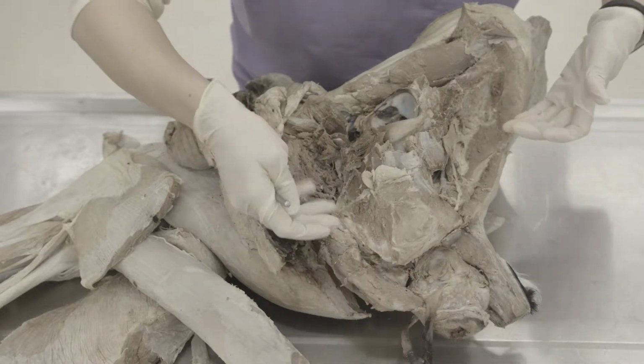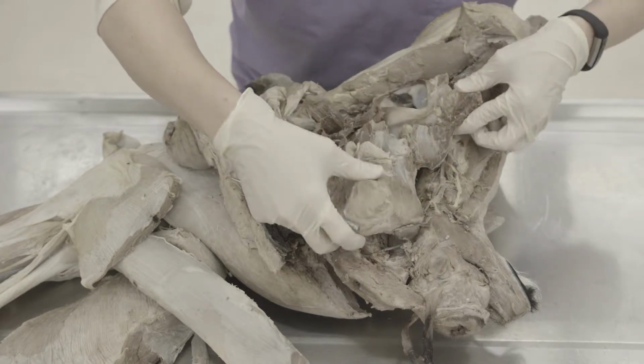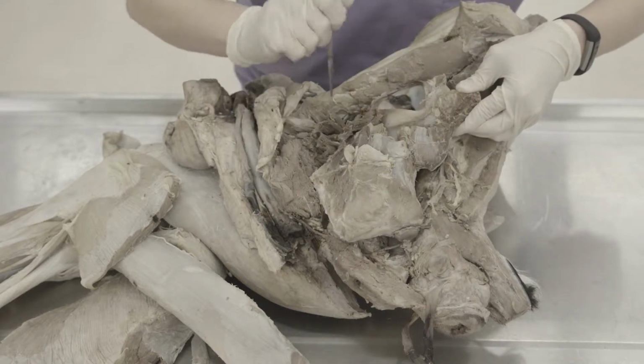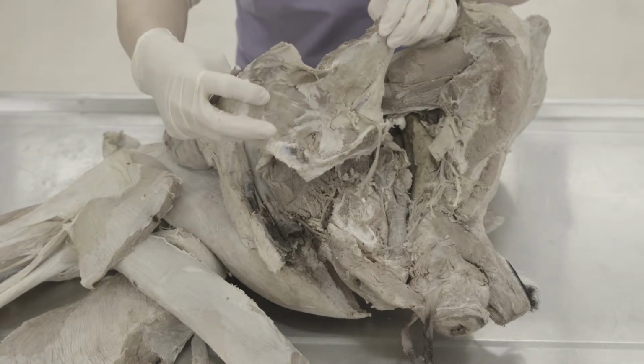So then you're going to make those cuts, and you'll actually take off the left half of the pelvis. So you'll have to cut around the parts of the pelvis to get it all the way off. So you want to cut through that soft tissue and then remove this part.